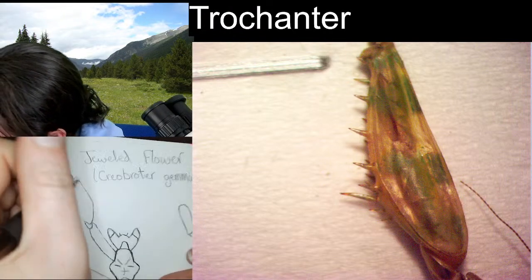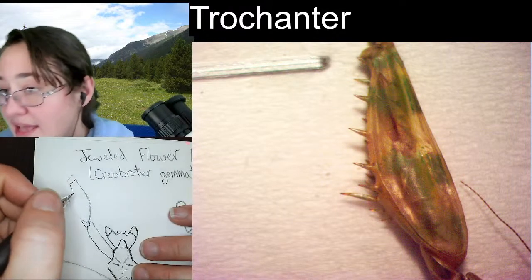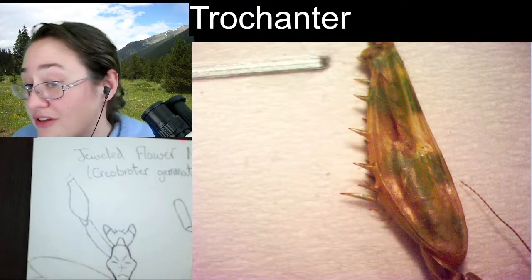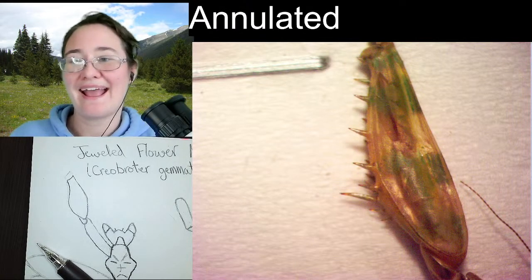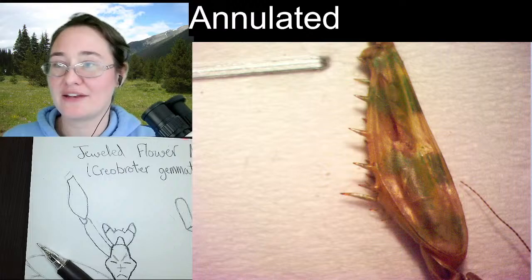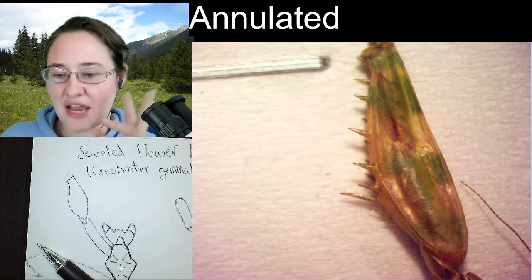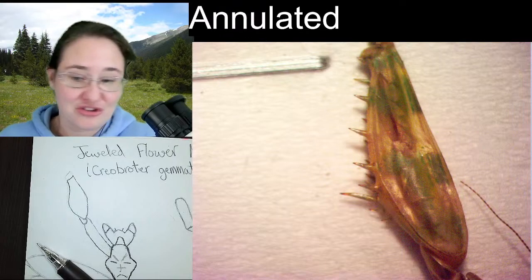And I think that I can use this word because the femur here, do you see how it has this kind of striping, but it's not striping like a textural stripe, right? It's a stripe in colors, green, yellow, green, yellow, green, yellow. We call color stripes annulated. So you could say that the profemur is annulated, green and yellow. I'm going to make sure I spelled that right. A lot of times annulated also means kind of ringed, but when it's a ring of color around the legs, then it looks like a striping, right?